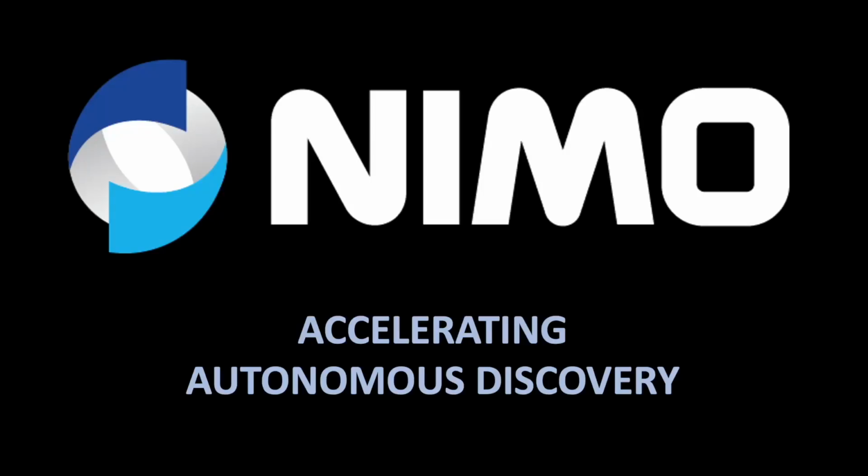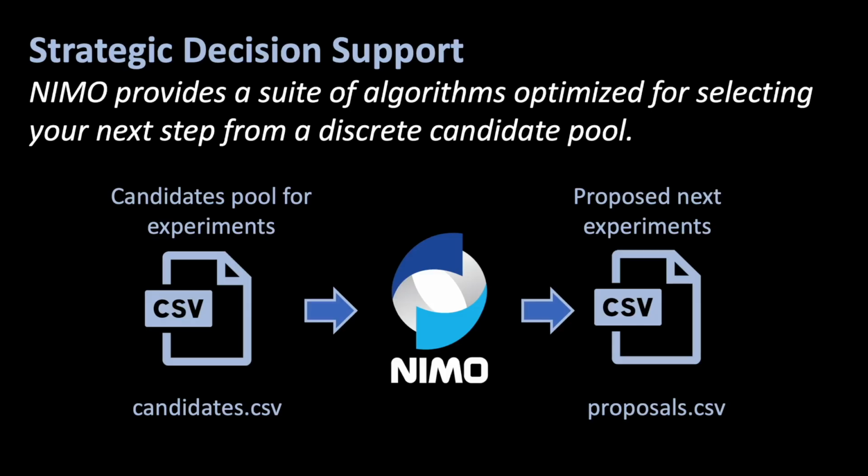NIMO is an open-source software package designed to accelerate autonomous materials discovery. NIMO provides a suite of algorithms optimized for selecting the next step from a discrete candidate pool. The candidate pool is prepared as a CSV file. By inputting the CSV file into NIMO, we can obtain the proposed next experiments, also as a CSV file.